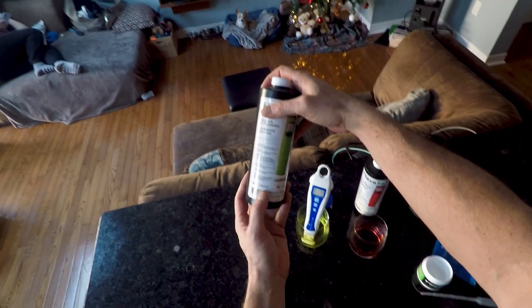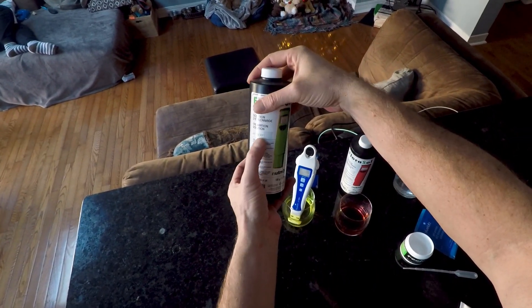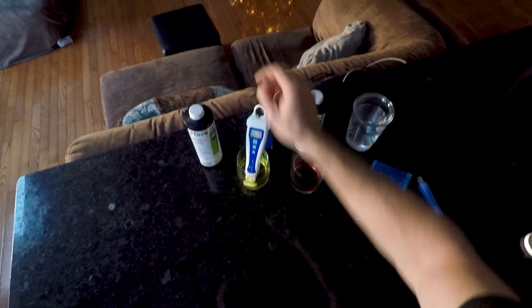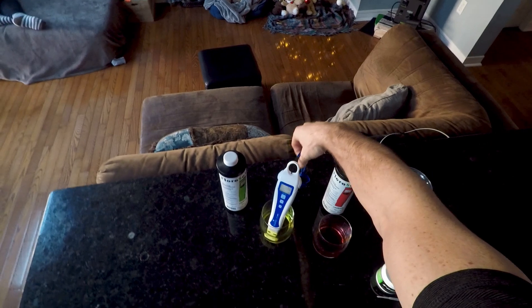It says here you're actually supposed to do it at 23 degrees Celsius. Bluelab is telling me it's 20 degrees. So not ideal, but we're gonna go with it.